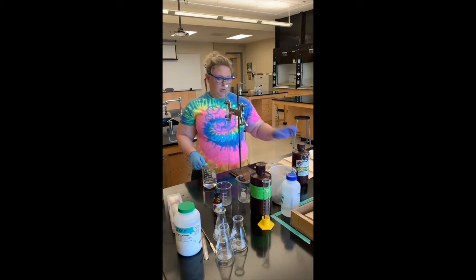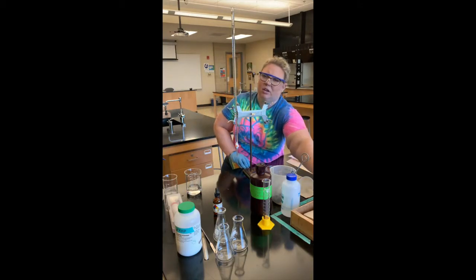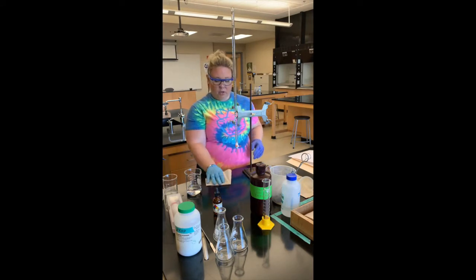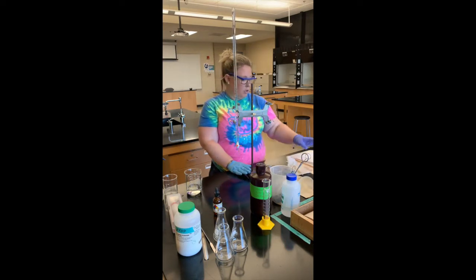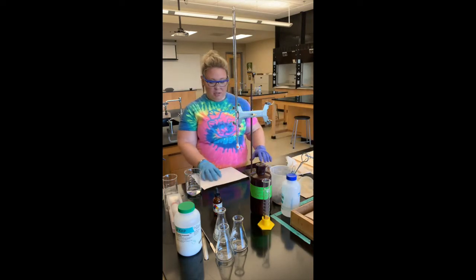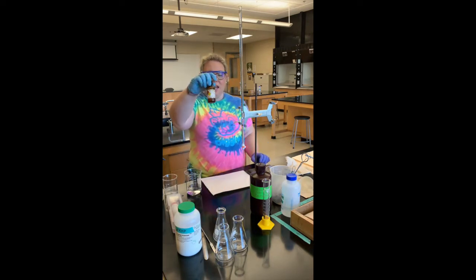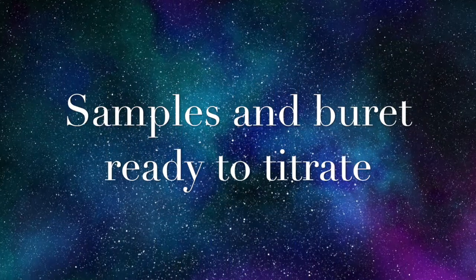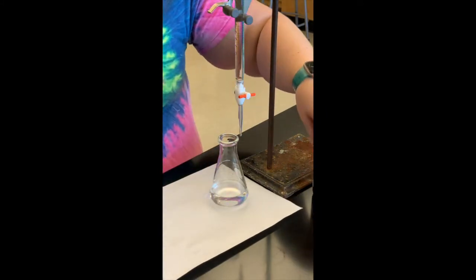The burette is ready to titrate. I'm going to go ahead and put a piece of white paper underneath it so I can see when the color change happens. This is similar to titrations done in CHEM 151 where you titrated to a pink endpoint — we're using the same phenolphthalein indicator. We're looking for that very light shade of pink that persists in our solution. I have all of my samples ready to titrate — I dissolved the KHP in water and then added two drops of phenolphthalein indicator.